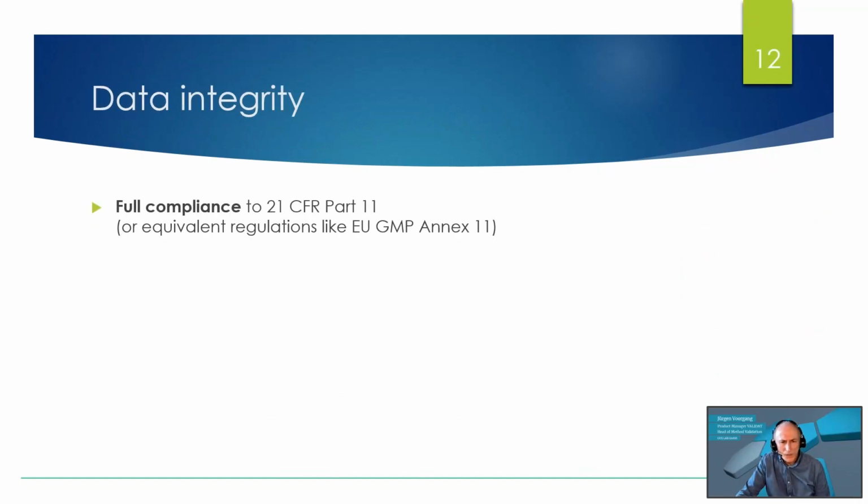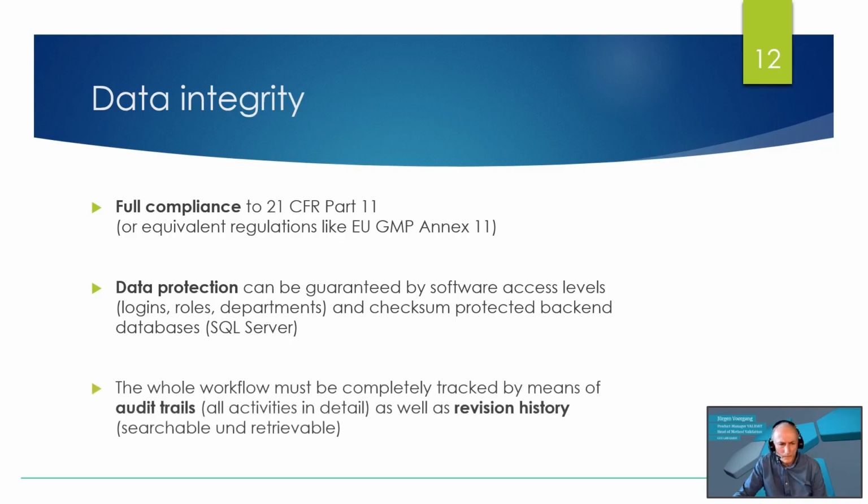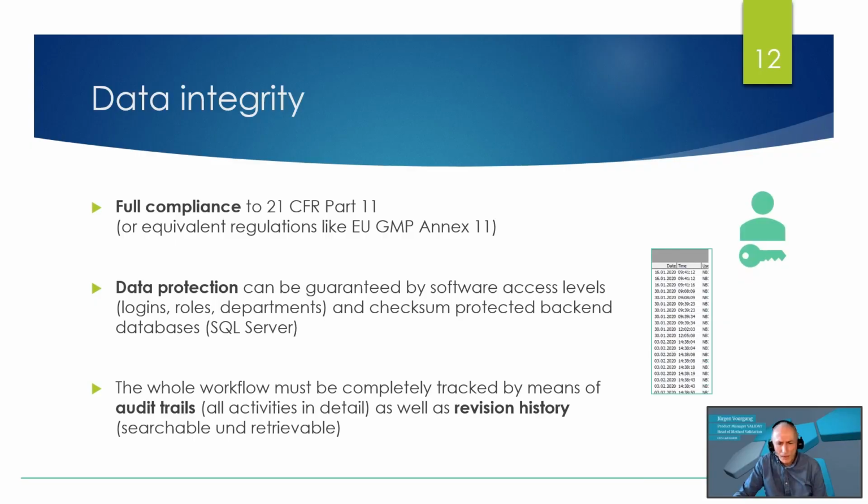Full compliance to 21 CFR Part 11 is mandatory, or to an equivalent regulation like EU GMP Annex 11. Data protection can be guaranteed by software access levels, like logins, roles, or departments, and checksum protected backend databases like SQL servers. The whole workflow must be completely tracked by means of audit trails, all activities in detail, as well as revision histories, searchable and retrievable.